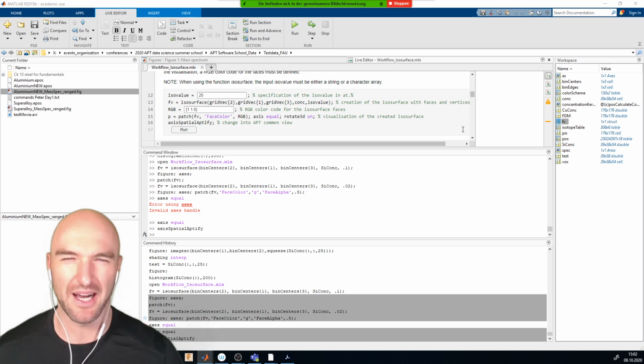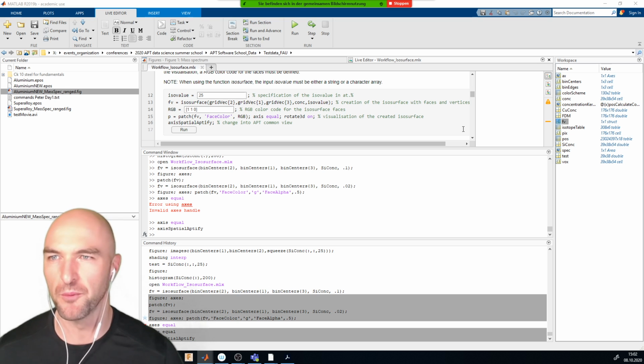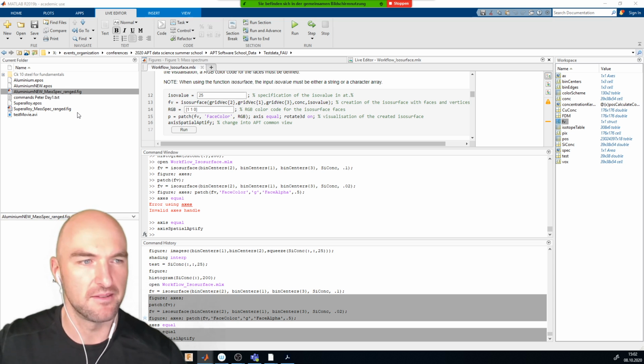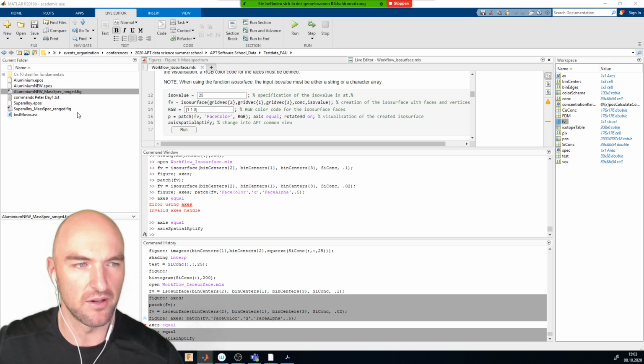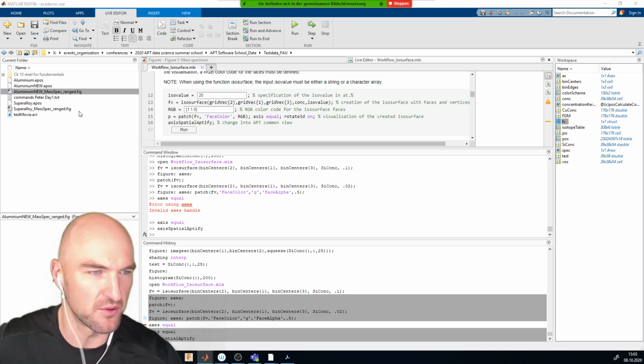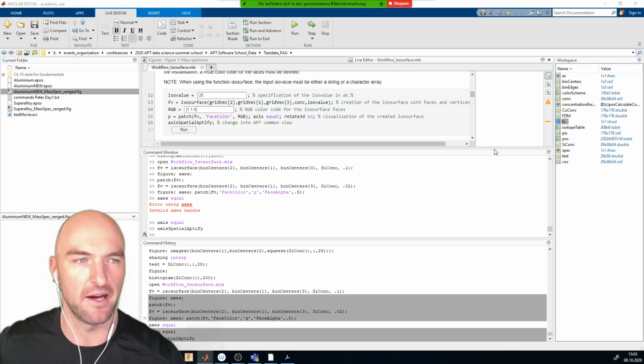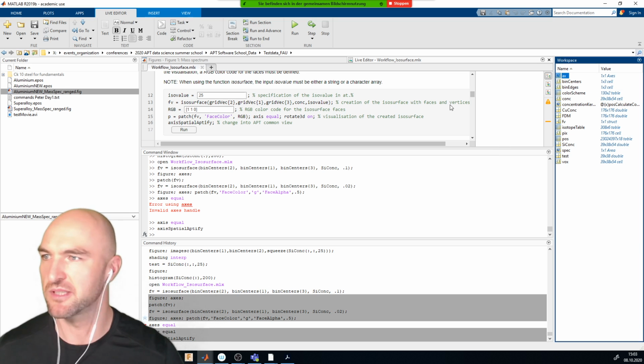But you know what? I think we will recalculate it tomorrow, because I think we will use the superalloy tomorrow because it's got some nicer looking things in it for isosurface analysis. Or maybe we'll do the aluminium. Who knows? But yeah, I will save the MATLAB workspace as well so that we can potentially do something with that.